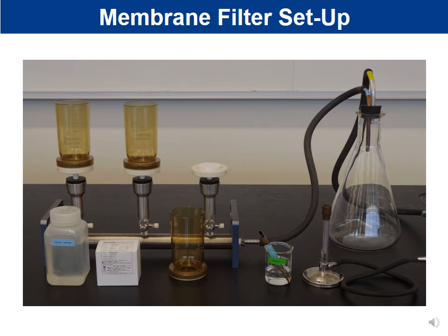And so what we would have out is we would have several things. So let me go ahead and put my laser pointer back on. So here is our flask, and the flask would collect the water that goes through the sample. Now, here on the left, here is our water sample that we would be testing. We have a box of nitrocellulose. This has individually wrapped sterile nitrocellulose filters. These are the collection cups, so they detach. So here's our collection cup setup.